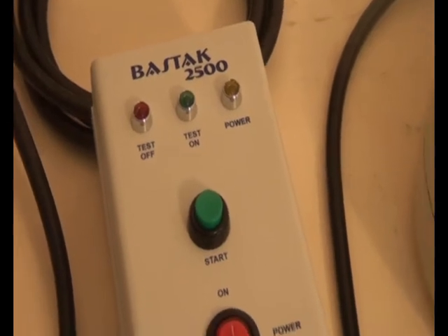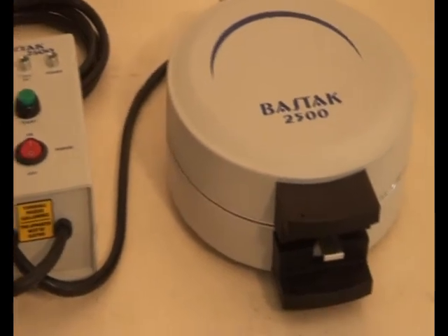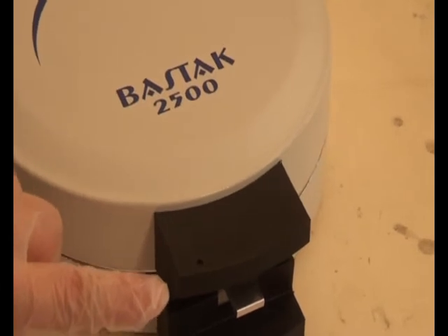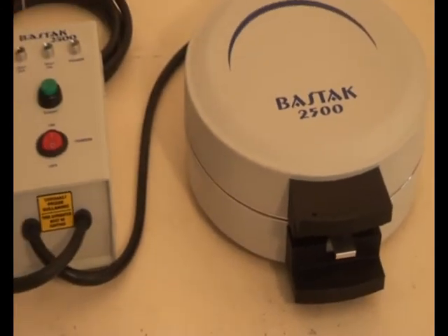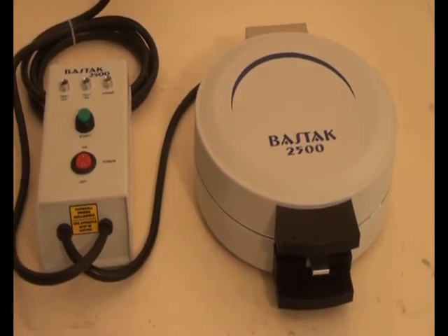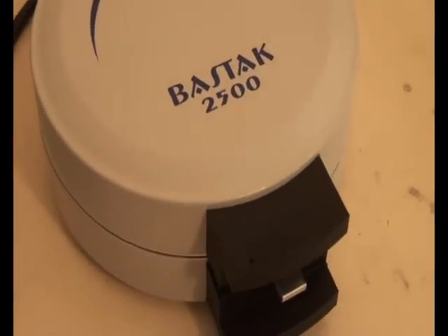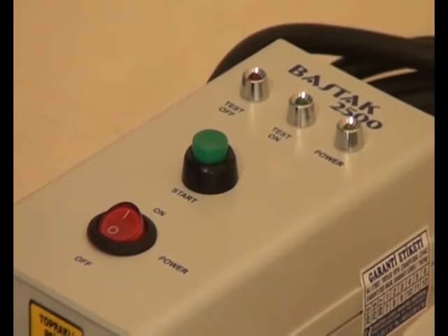There is also a warning light on the hand of the machine to indicate whether the resistances are working, known as the thermostat light. The machine is set by default to 150 degrees Celsius according to world standards. When the heat reaches 150°C, the warning light will turn off. As a special request, the heat can be adjusted by the manufacturer.